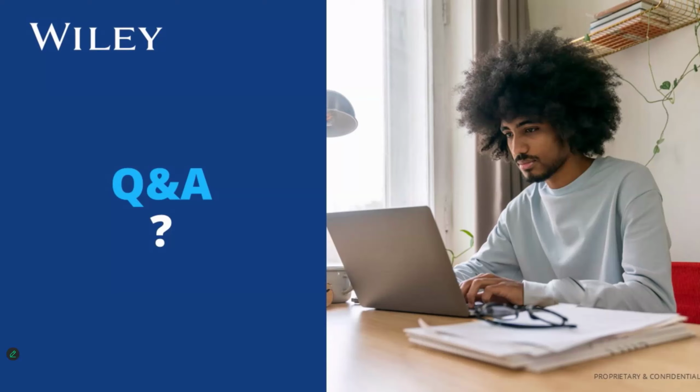Great. Thank you, Michelle. Let's see, we might have time for another one here. Can you tell me a little bit more about spectral data management in KnowItAll? You had mentioned that audit trails were being added, but I wanted to know more about building databases in general.